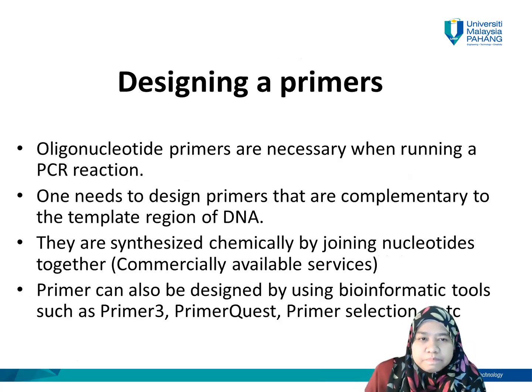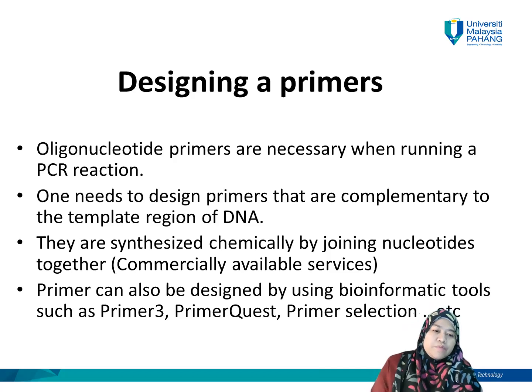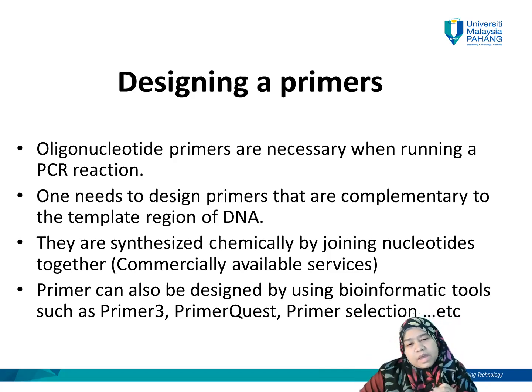Okay, designing a primer. As you know, oligonucleotide primers are necessary when running a PCR reaction. One needs to design primers that are complementary to the template region of DNA. Firstly, in designing the primer, you should have the gene of interest sequence, whether you already have it in GenBank, or you can also find a related member of the same family or genus of the organism that you want to study.